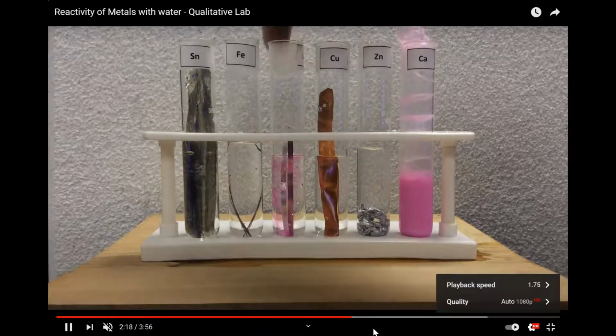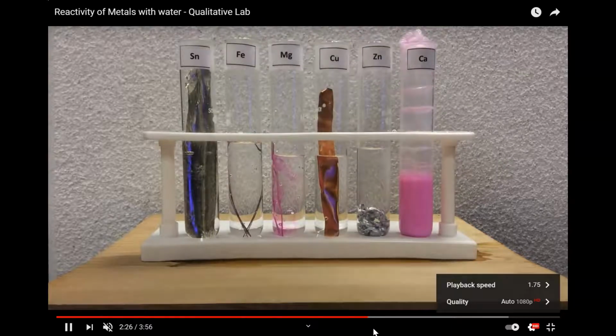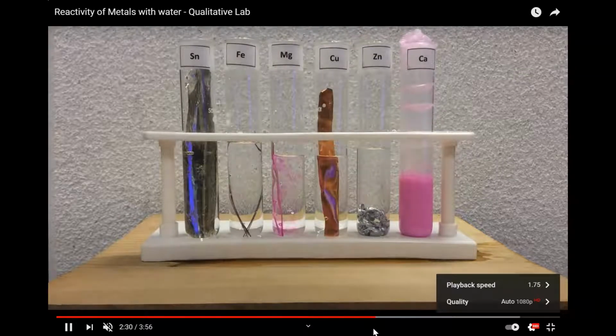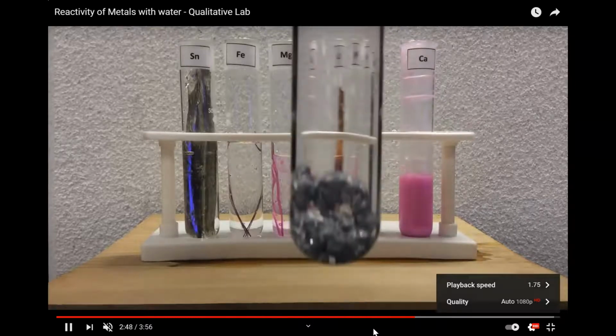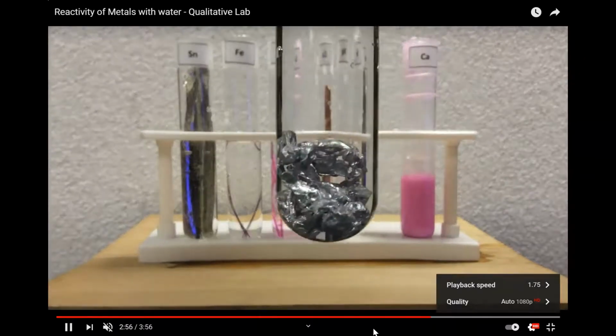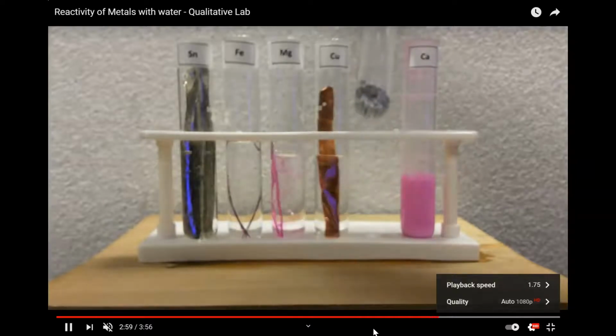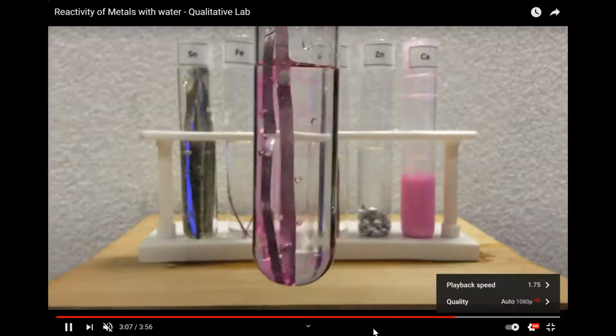All right, there it is. And you can see that the calcium did actually dissolve. Oh, there we go, getting a bit more pink. Now, what about the other ones? Having a closer look at the zinc, nothing there. Sometimes you see the reflection and you think it's actually a color change, but it's not. I'm going to get a look at the magnesium, which is clearly pink.